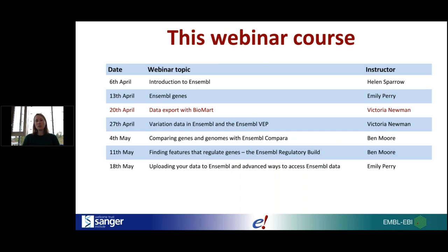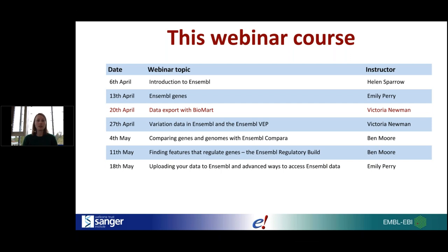The webinar series will cover seven weeks in all, and we are at week three. Some of you will have seen my colleague Helen's presentation giving an introduction to Ensembl, or last week's presentation with my colleague Emily, where she introduced methods for annotating genes and transcripts in Ensembl. Today we're going to talk about the BioMart tool, which you can use to export data from Ensembl.